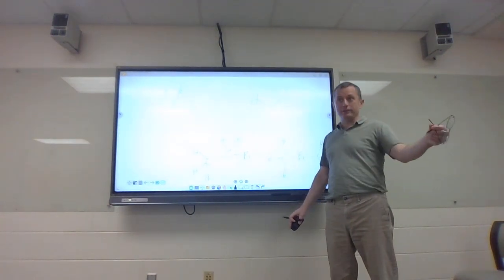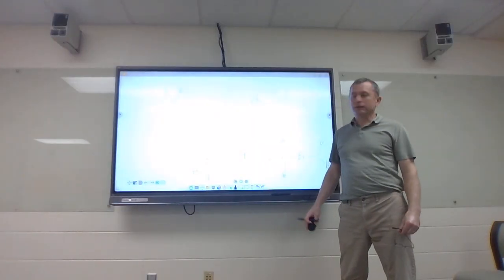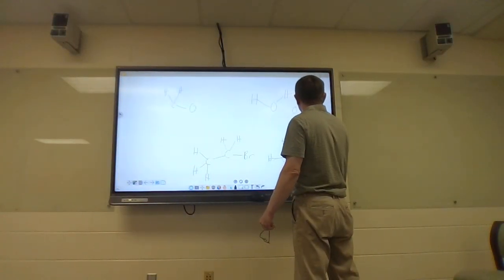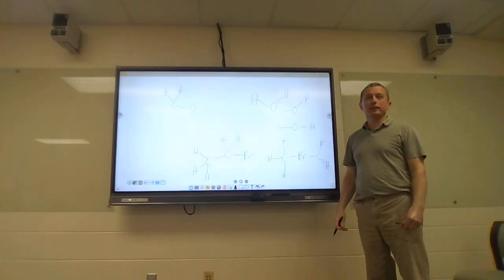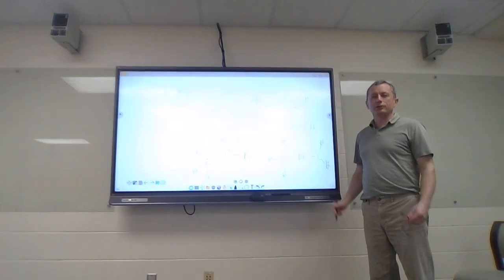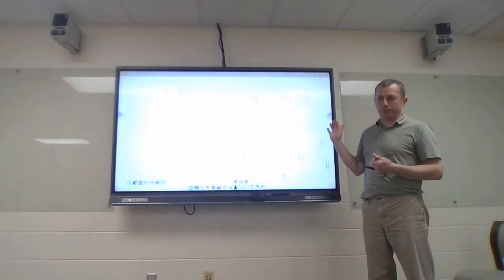So it's fine, but explore those possibilities. You hit a roadblock as soon as you want to do that. Or the only other way you could do this would be to say I have 2 oxygens with 2 hydrogens on it, and they're somehow connected. But your molecular formula says one oxygen. That's a no-go. So you can't make the integration and that chemical shift work.